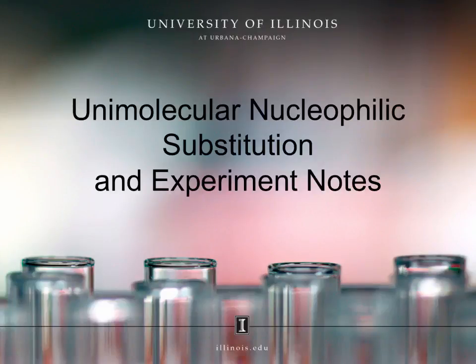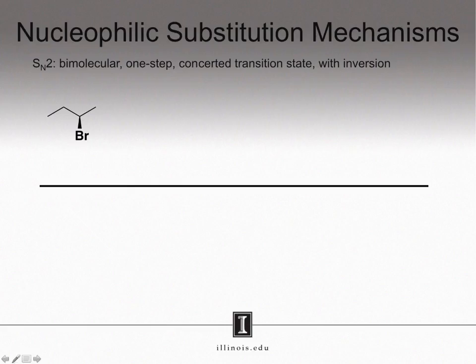Unimolecular nucleophilic substitution and experiment notes. In this webcast, we will discuss the background of the unimolecular nucleophilic substitution, or SN1 for short, reaction that you will perform. In this experiment, you will be performing a unimolecular nucleophilic substitution, or SN1 for short, reaction.